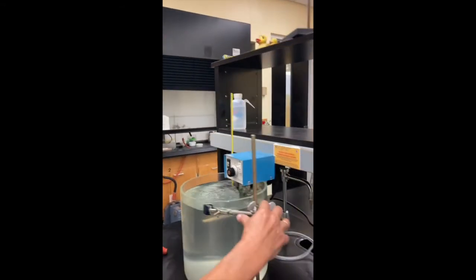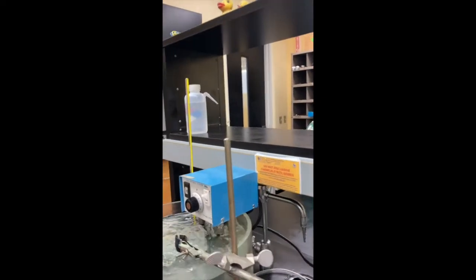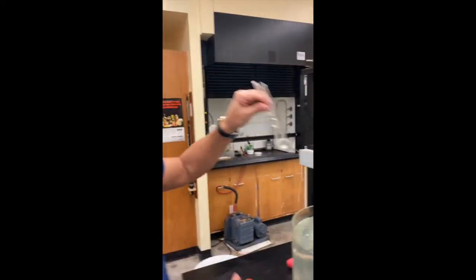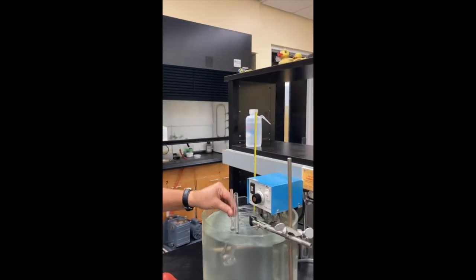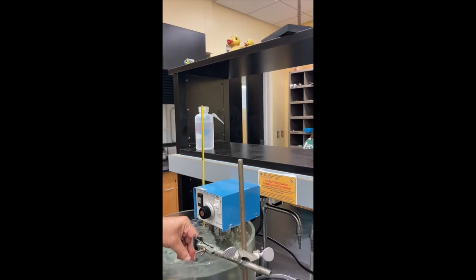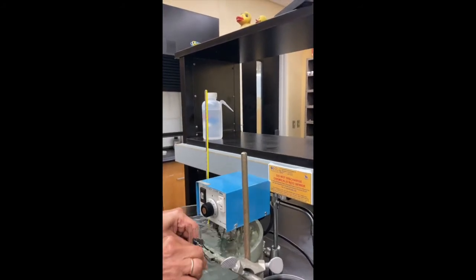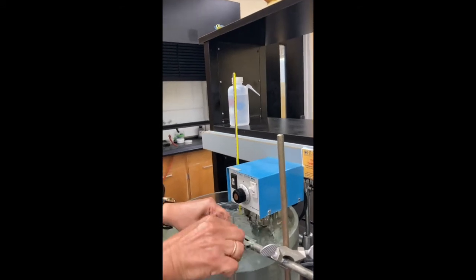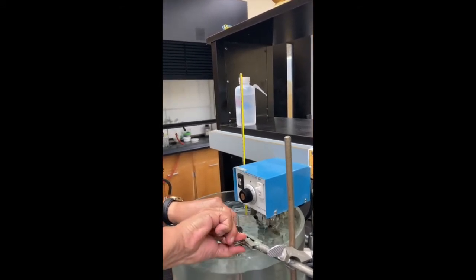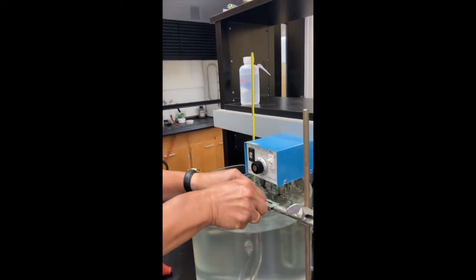Another thing, when we put our viscosimeter into the water bath, it is important that the tubes are located vertically.